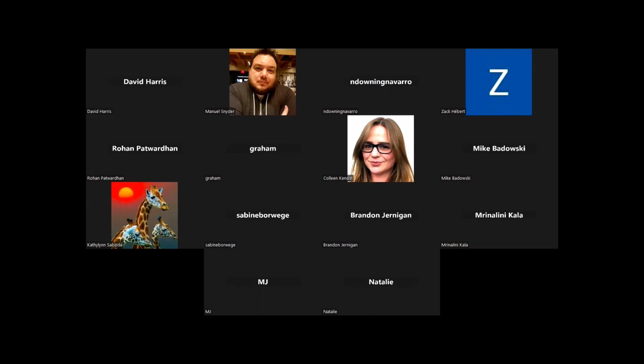But for such purposes, as you mentioned in the second part, that it is a one-time activity or some unknown person who is never going to have access to the system, we have a type of user called a contact user. So all you can do is just create a contact user and assign that contact user as the pre-entered investigator. Does that answer your question?